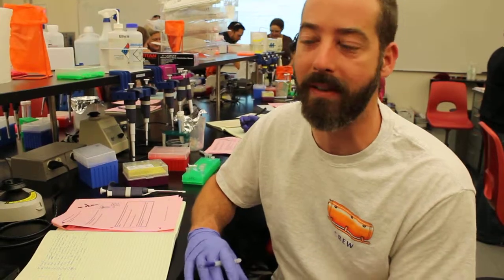So this program has been outstanding. It has all the scaffolding my students need to get into the idea of extracting DNA and not just stopping there, but using the DNA information.